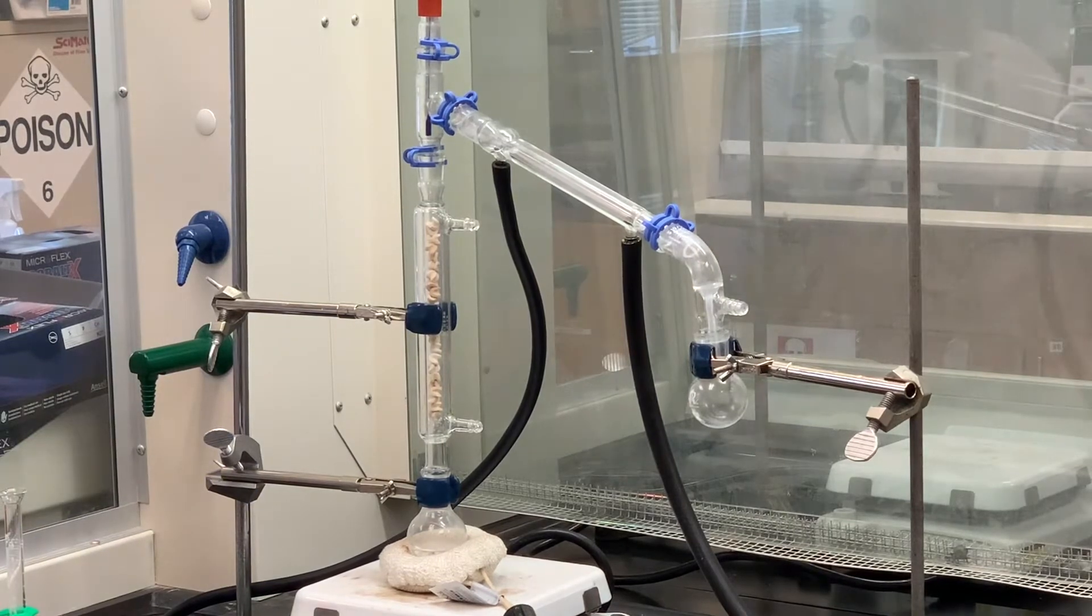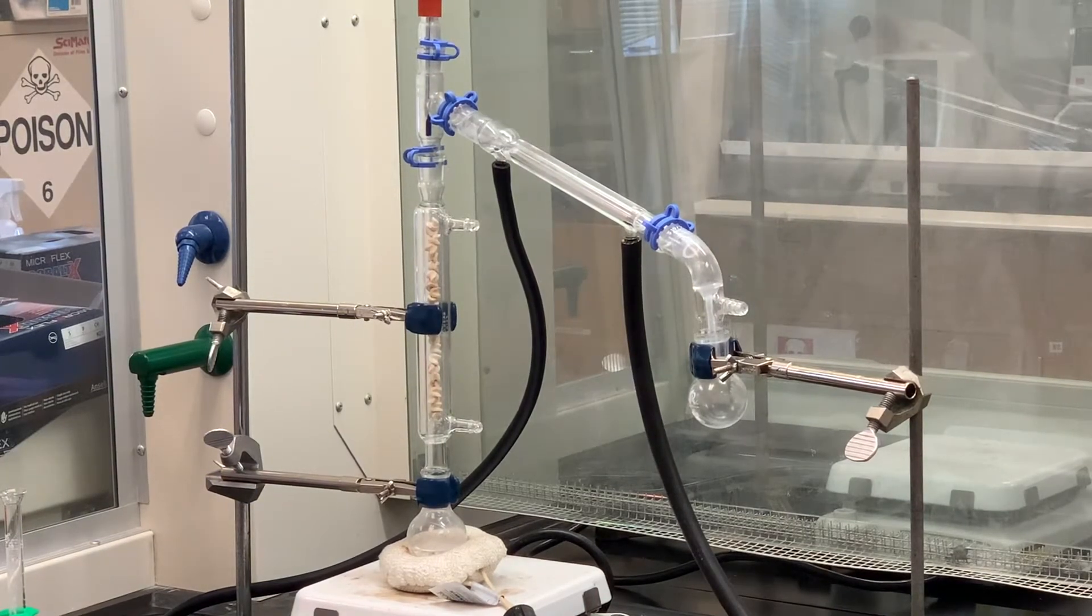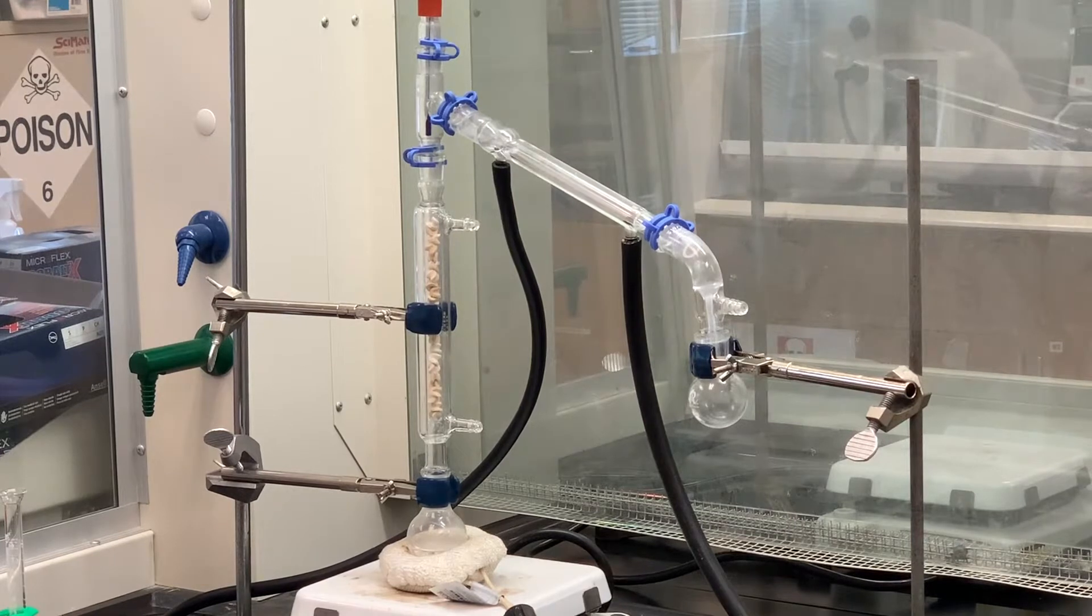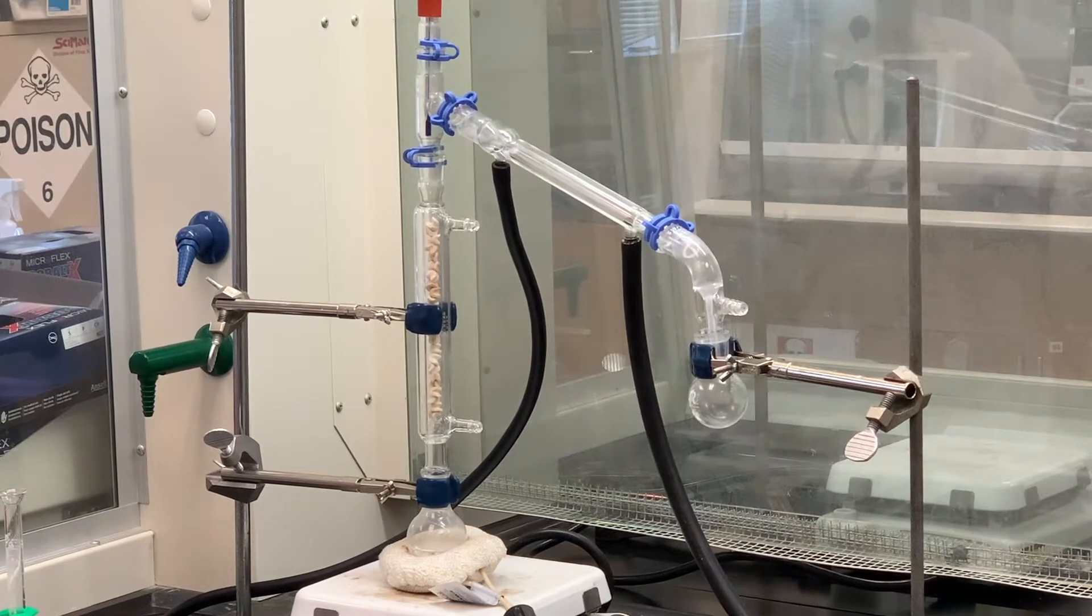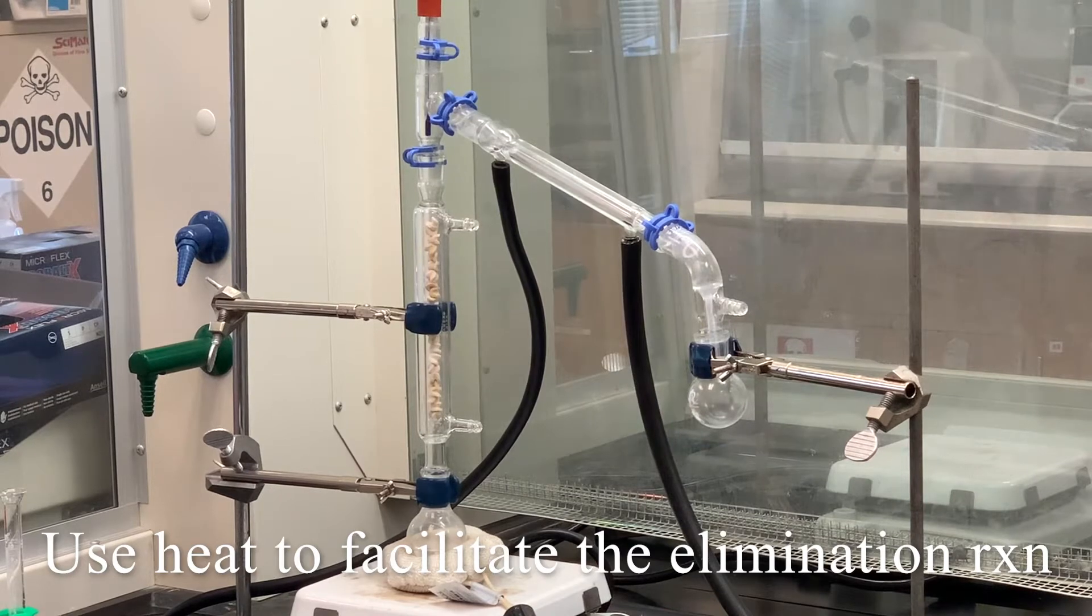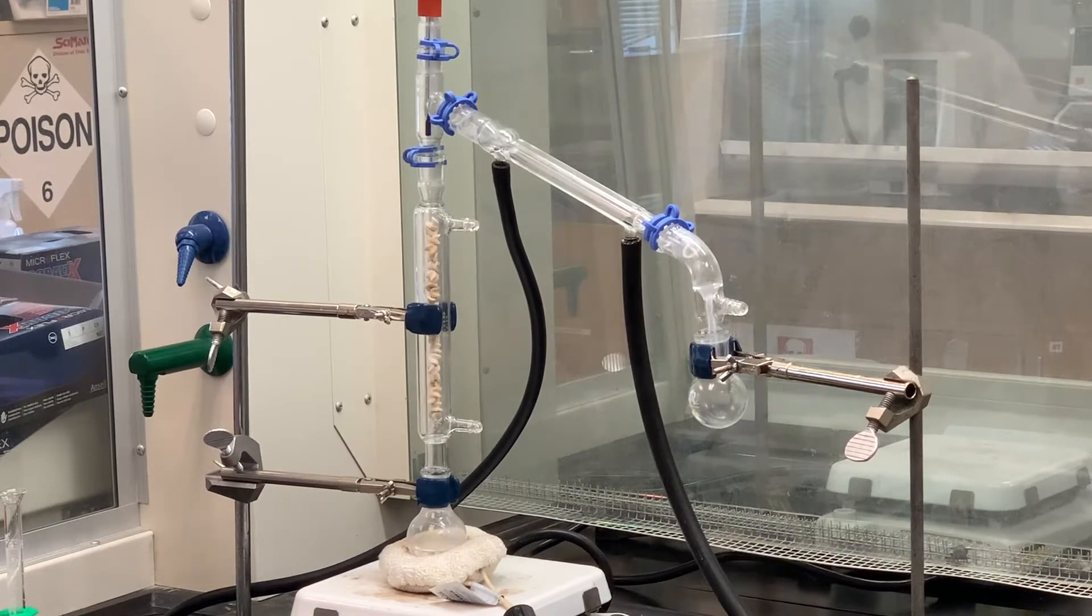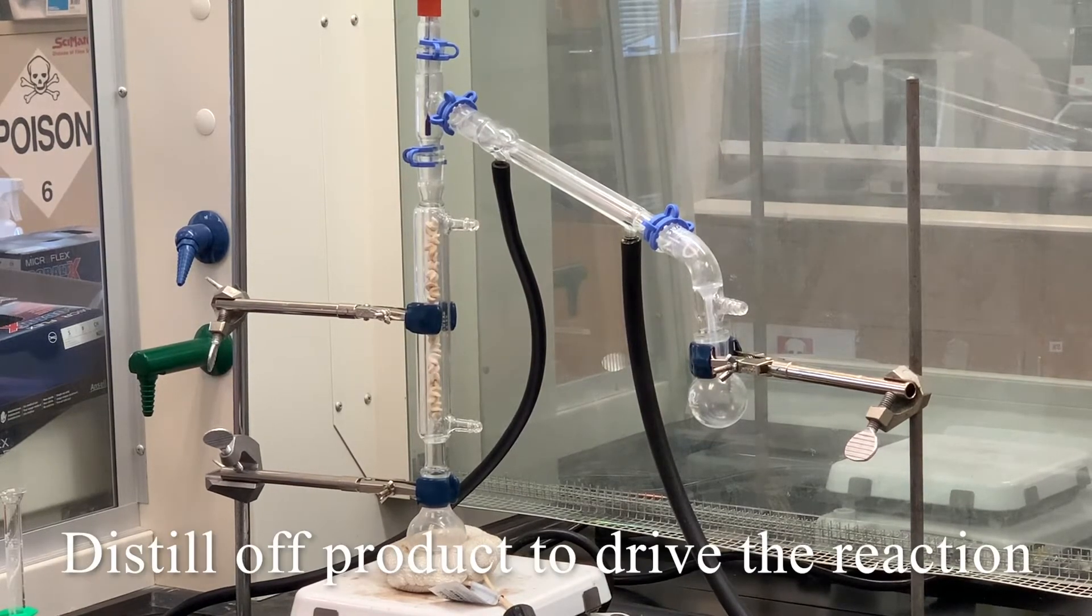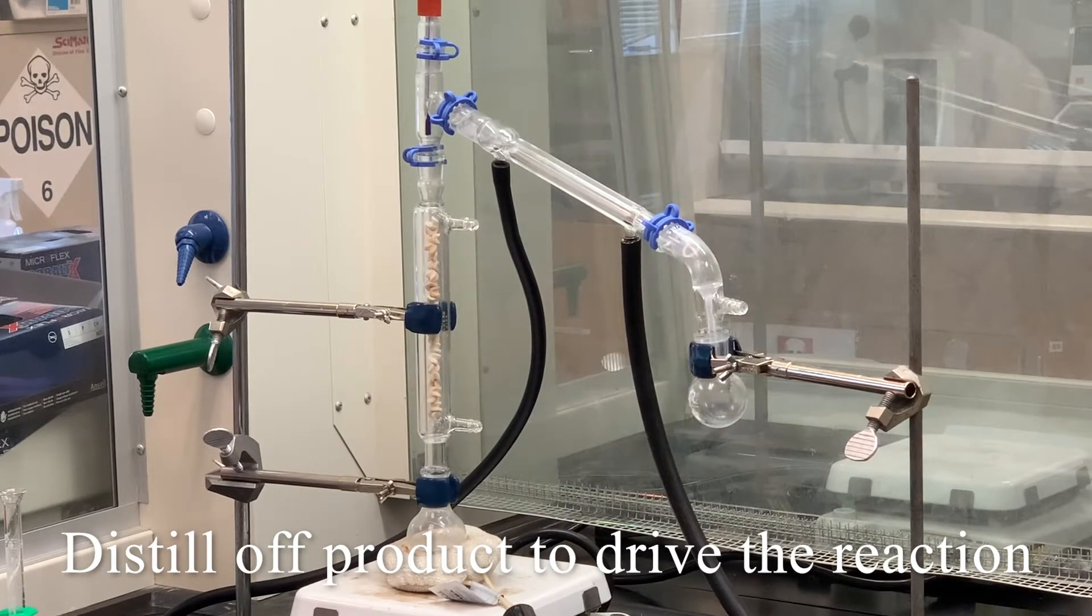And every time you have a substitution elimination reaction, they always compete with each other. Those steps are at equilibrium. So for today's lab, usually heat facilitates more of an elimination mechanism rather than the substitution.